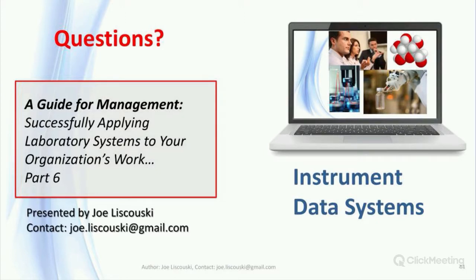But would it be nice to have access to different types of processing software so that you could buy one vendor's product and someone else's instrument data handling material? So what's driving it is you. You've got to tell people what you want and how you want your labs to work and what the problems are that need to be solved. And that's going to become more acute as automation comes in and starts really driving things, as human labor is replaced with machine labor, and people spend more time analyzing information and interpreting it, as opposed to just manually carrying out procedures.